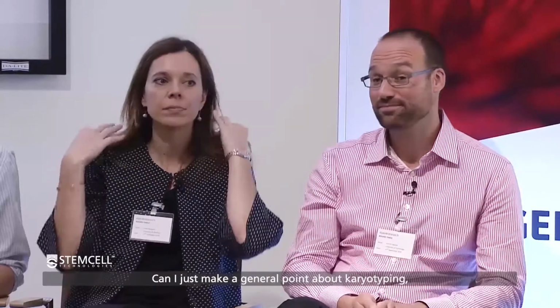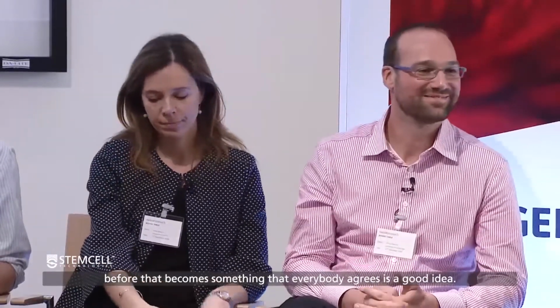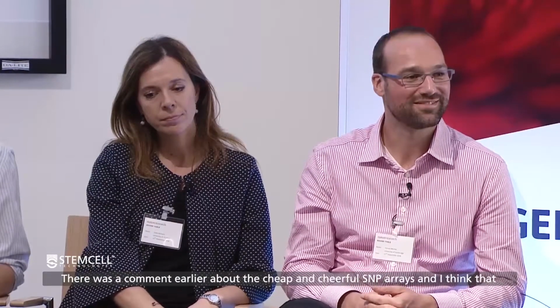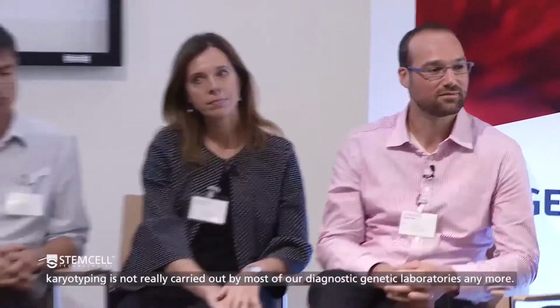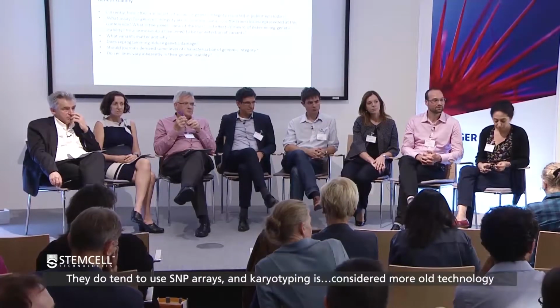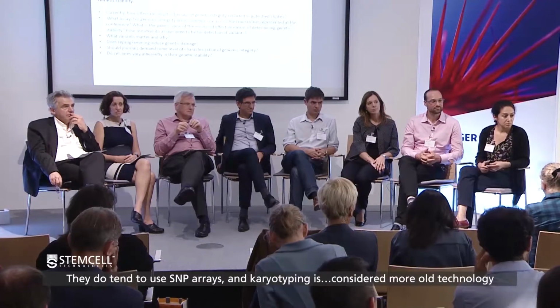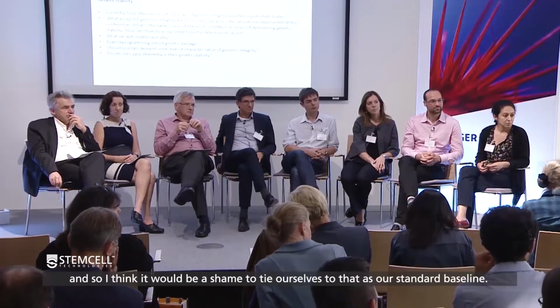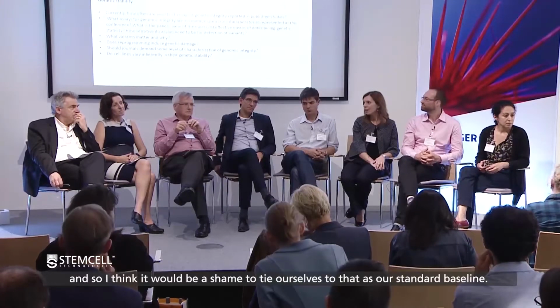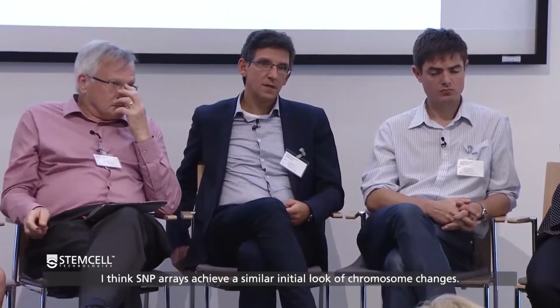It would have been very helpful, I think, to be able to trace back what the life history of those cell lines were. Can I just make a general point about karyotyping, before that becomes something that everybody agrees is a good idea? There was a comment earlier about the cheap and cheerful SNP arrays, and I think that karyotyping is not really carried out by most of our diagnostic genetics laboratories anymore. They do tend to use SNP arrays, and karyotyping is considered more old technology, so I think it would be a shame to tie ourselves to that as our standard baseline test. I think SNP arrays achieve a similar initial look at chromosome changes.